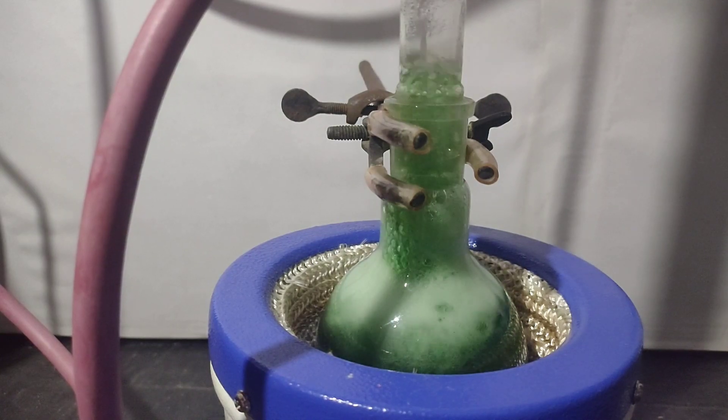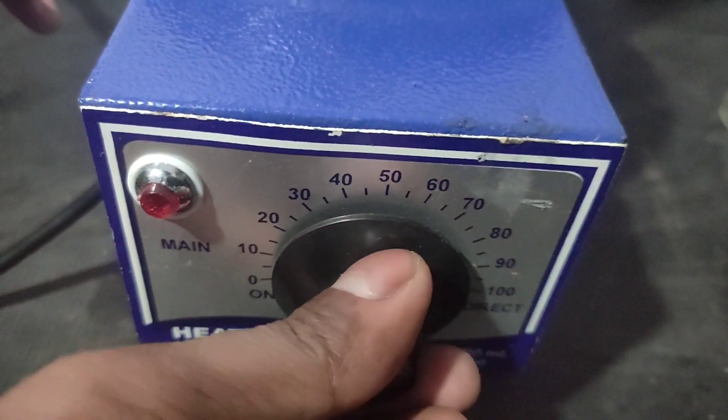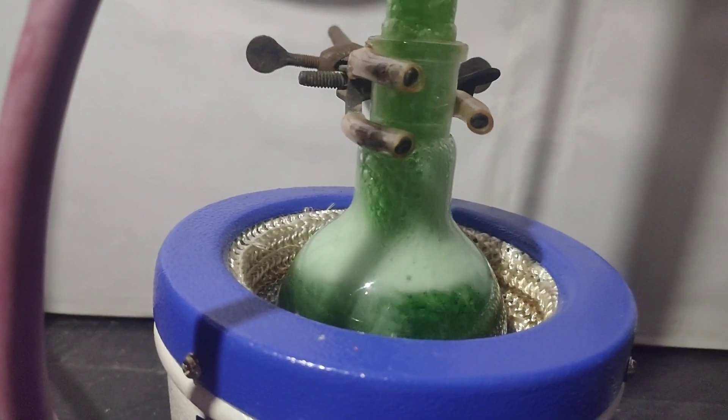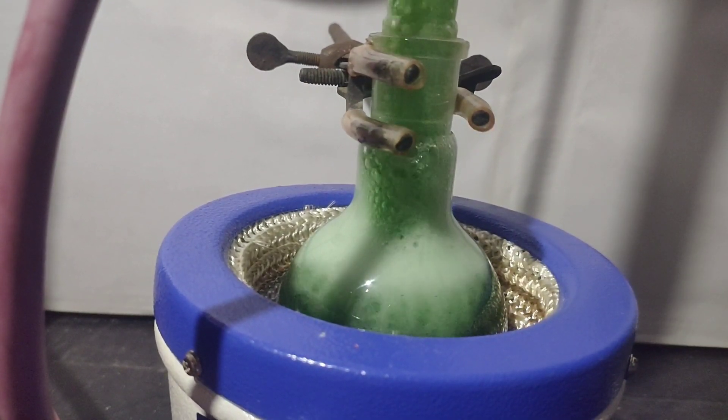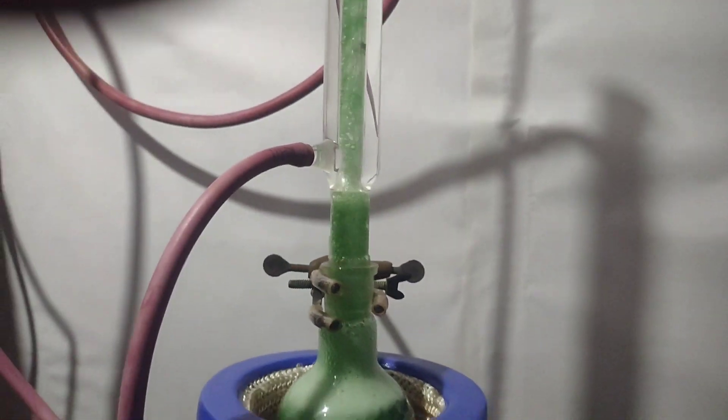When the reaction went vigorous, I switched off the heating mantle. It foamed but didn't come out of the condenser. Iron and chromium is reacting with hydrochloric acid to form iron(II) chloride and chromium chloride respectively, with evolution of hydrogen gas.